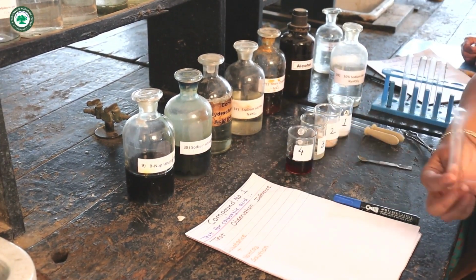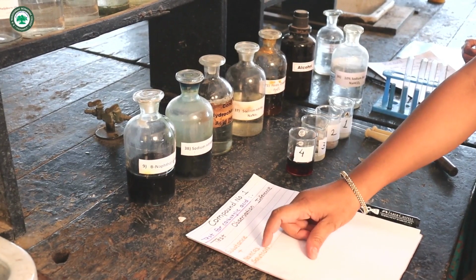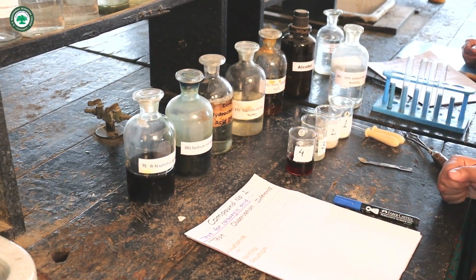Test is substance plus sodium bicarbonate solution.